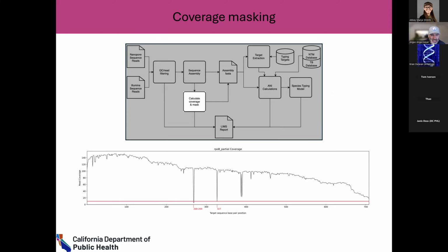What I found, looking at a lot of these samples, is that we haven't totally figured out exactly why this happens, but it happens frequently enough to be a problem. We'll get exceptional coverage, averaging about 100 or 120 across the gene. This is just one of the target genes; it happens to different genes at similar rates. But you'll get these tiny little dropouts, sometimes just a couple of nucleotides or a single nucleotide, that will dip just below this cutoff.